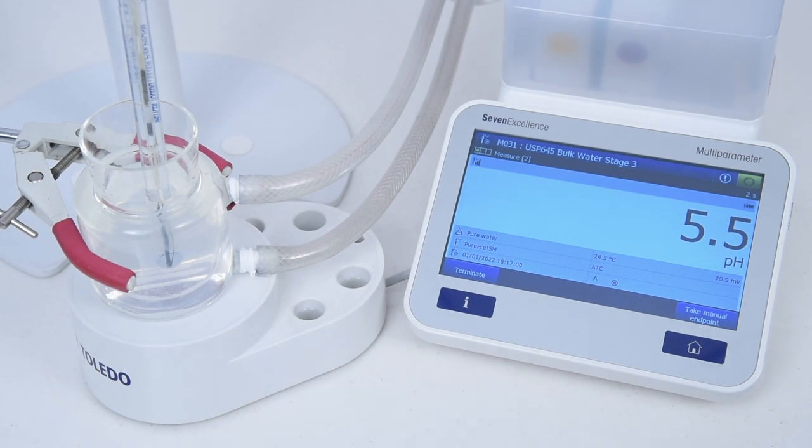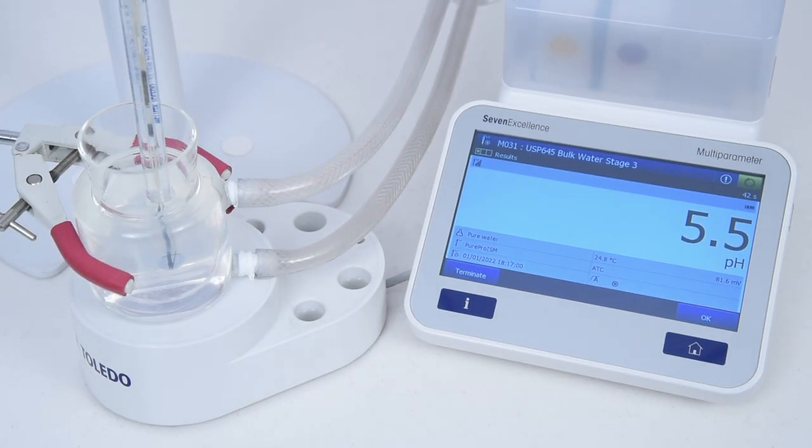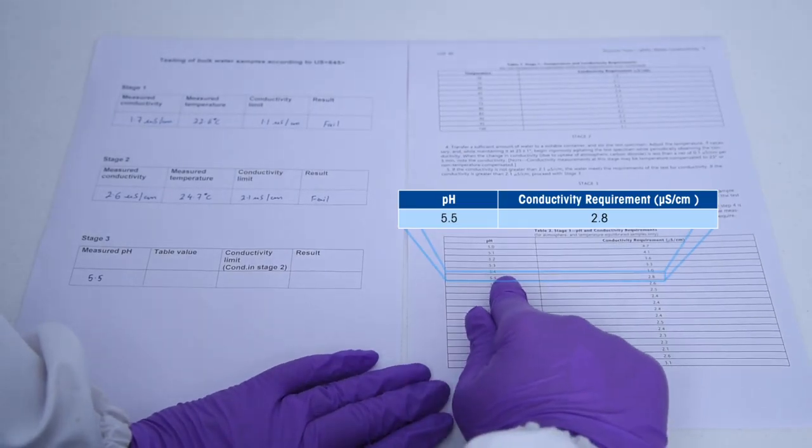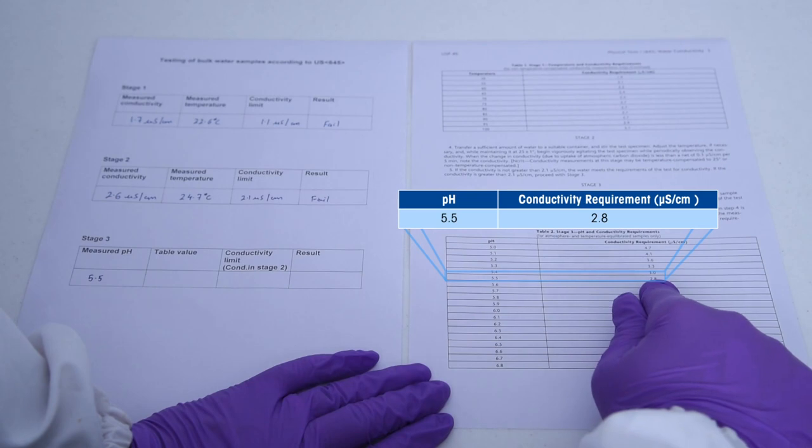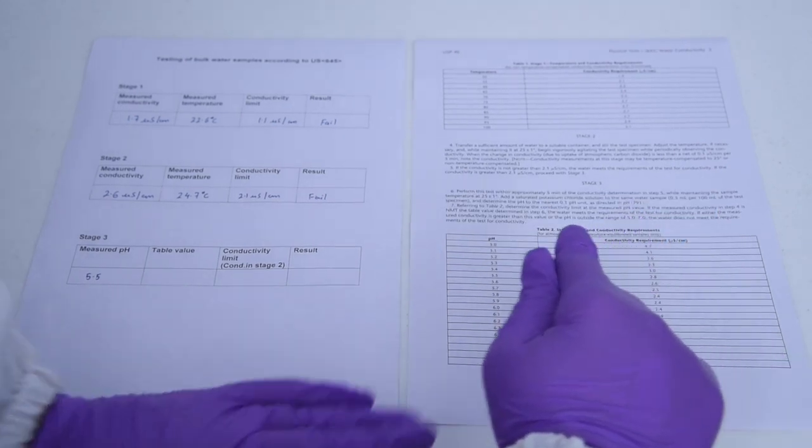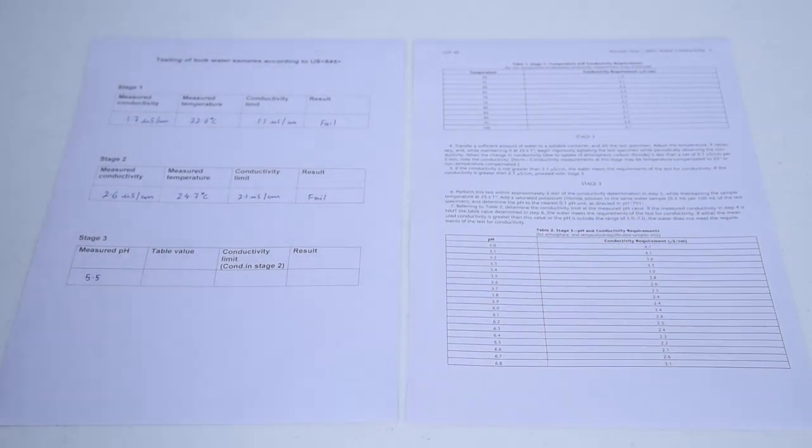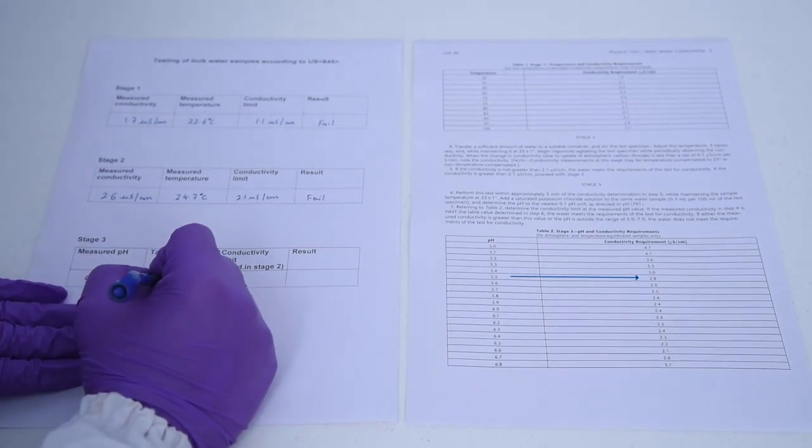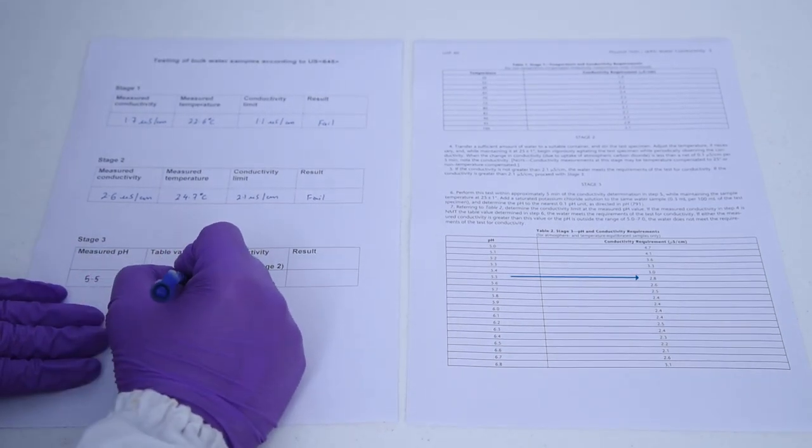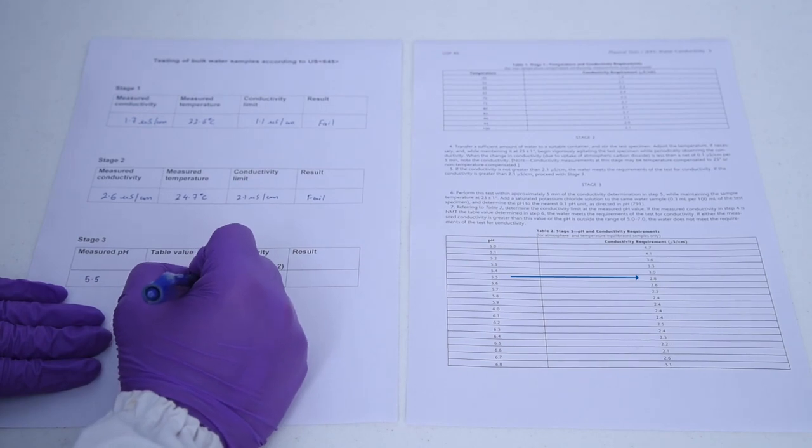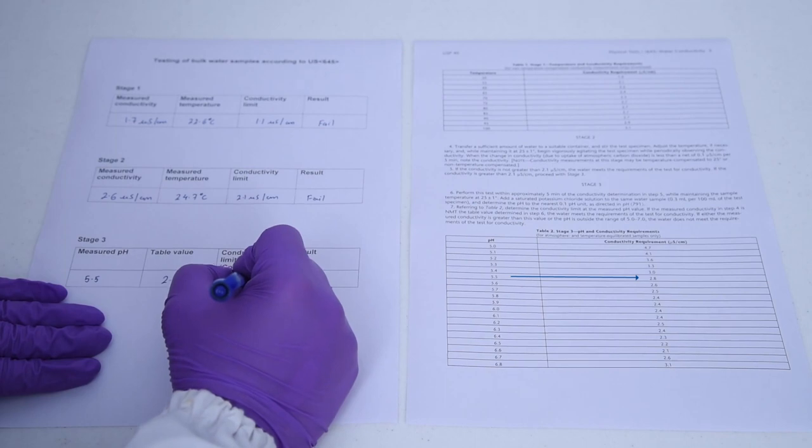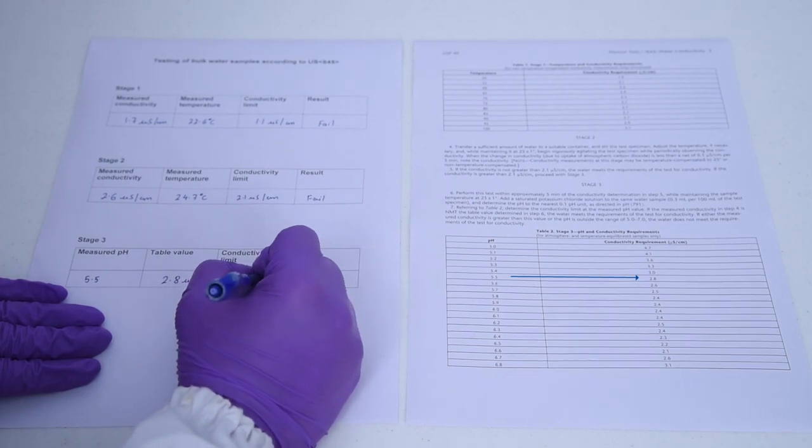From the reference table, determine the limit conductivity value at the measured pH. If the conductivity value measured at stage two is less than the value determined from the table, the water meets the requirements of the test for conductivity. If the conductivity value is bigger than that, or if the pH is outside 5.00 to 7.00, then the water does not satisfy the requirements of USP 645.